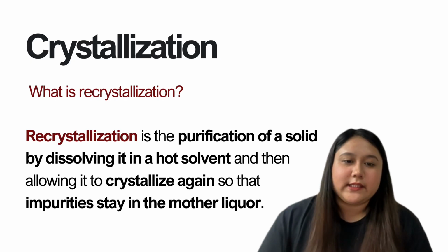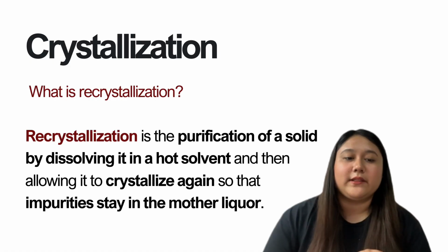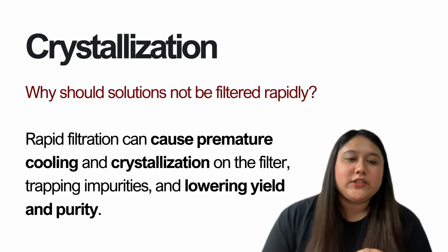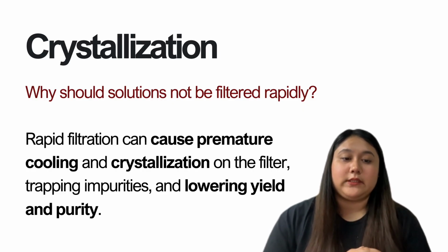What is recrystallization? Recrystallization is the purification of a solid by dissolving it in a hot solvent and then allowing it to crystallize again so that impurities stay in the mother liquor. Why should solutions not be filtered rapidly? Rapid filtration can cause premature cooling and crystallization on the filter, trapping impurities and lowering yield and purity.